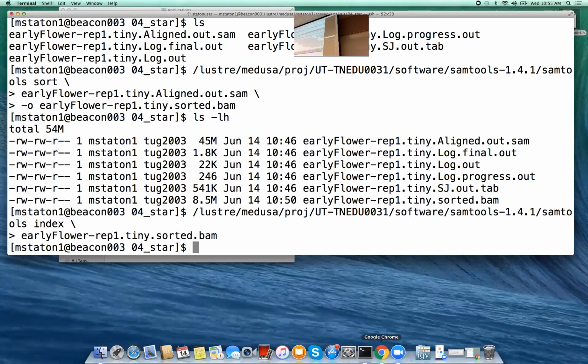We loaded up a much bigger set of reads. So where are you at? 3 at 5,007,000. See if that's the same thing. So yeah, mine is the same. If I zoom out, I've got one little tiny read too.